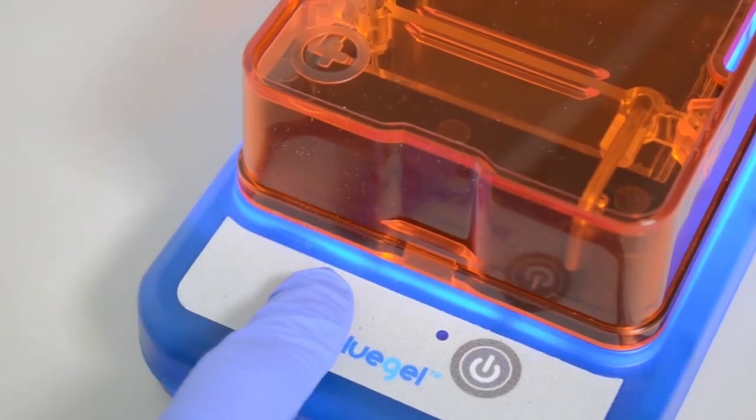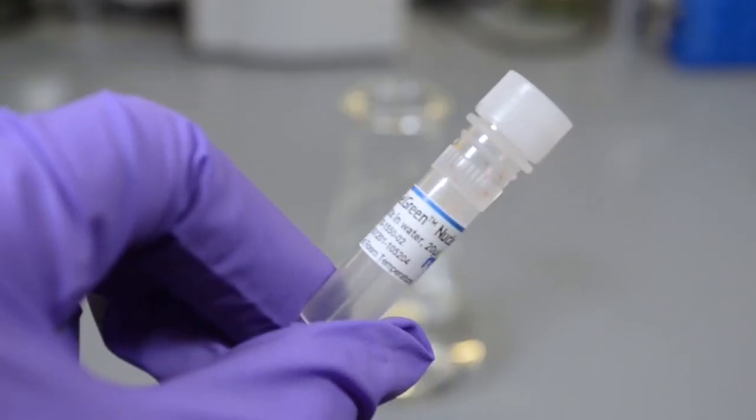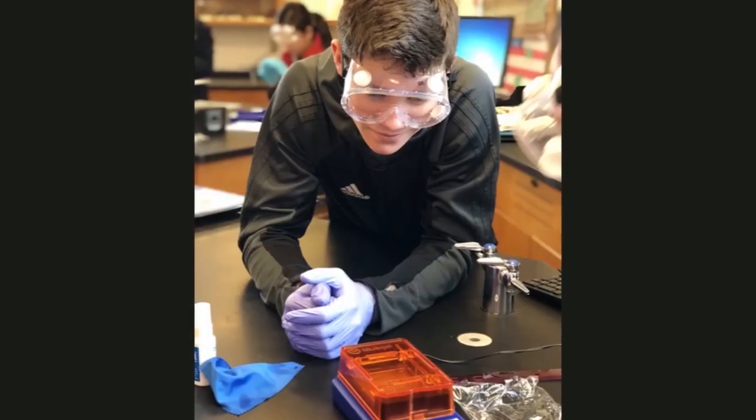BlueGel uses blue LED light rather than harmful UV, making it compatible with a new generation of safe green DNA dyes and eliminating exposure to reagents like ethidium bromide.